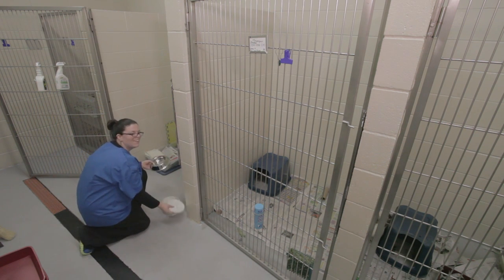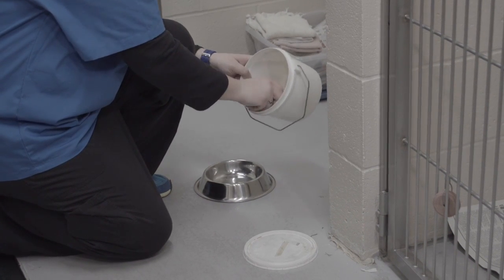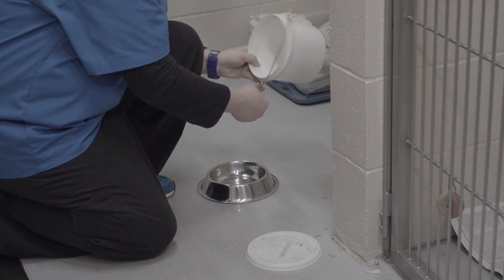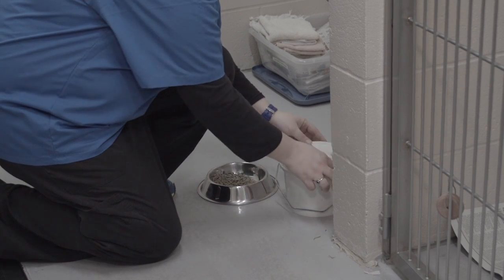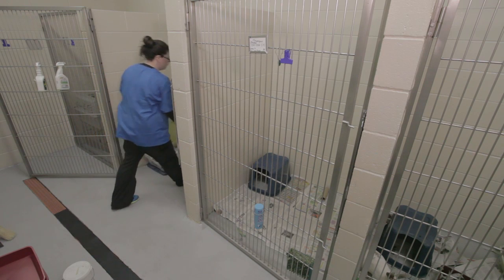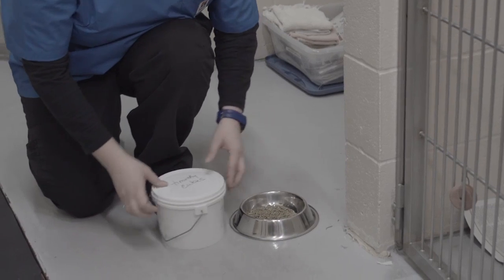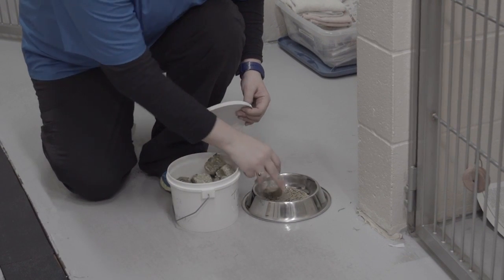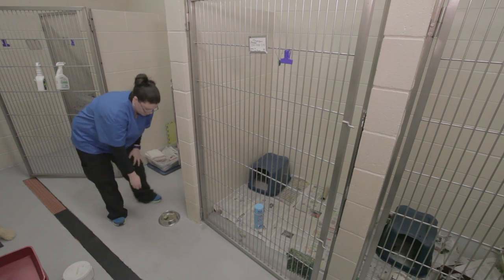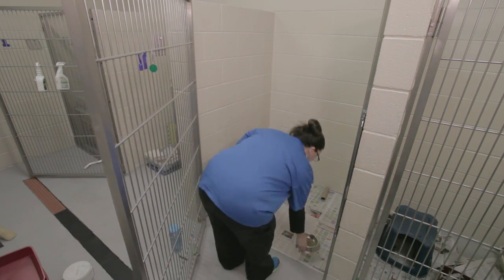and then we just get a scoop — one scoop — and these get refilled. And then a block of Timothy cubes. Go off to the sides.